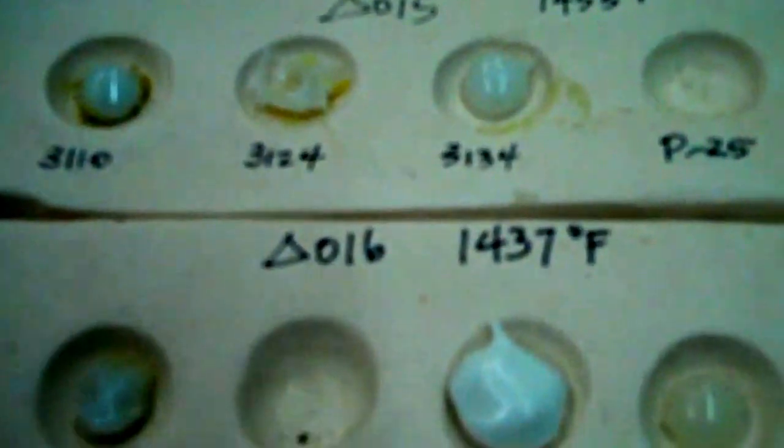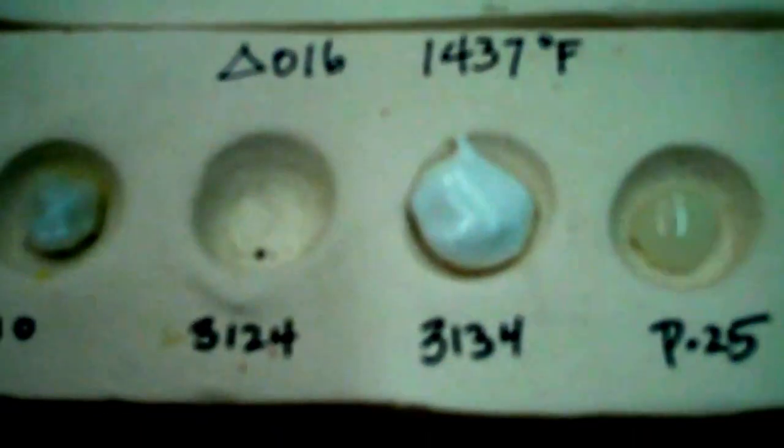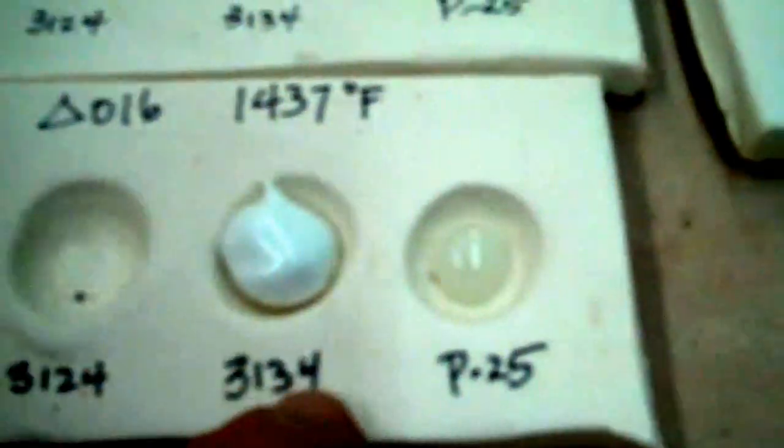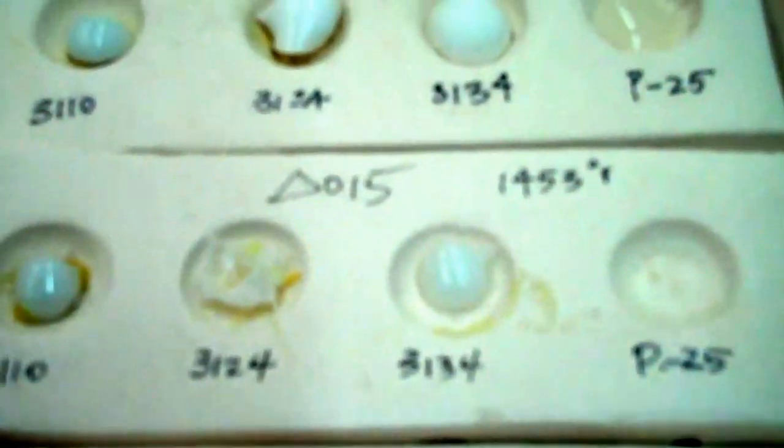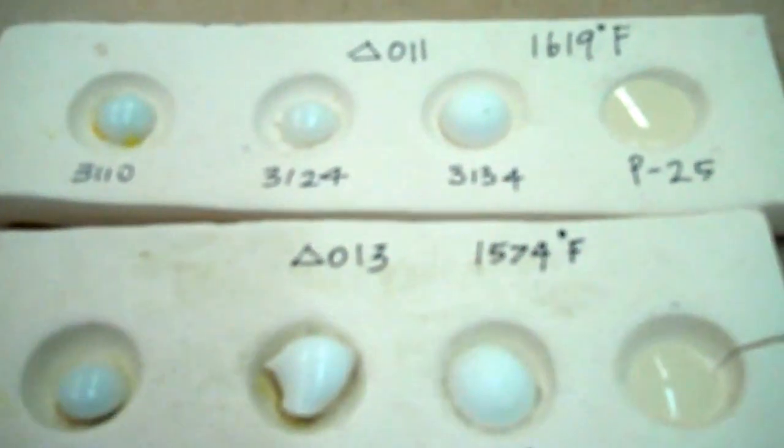Or, for instance, on this test, I melted frit 3110, 3124, 3134, P25. And then I melted them at all different temperatures. So that helped me understand something about the melting point of feldspar.